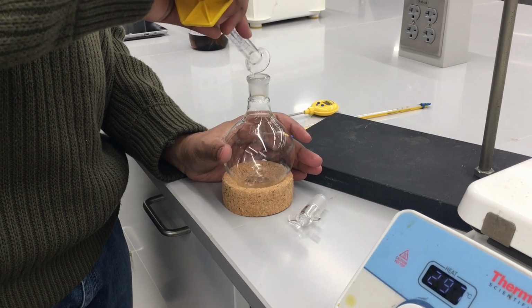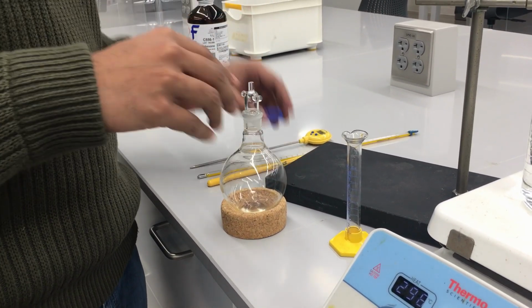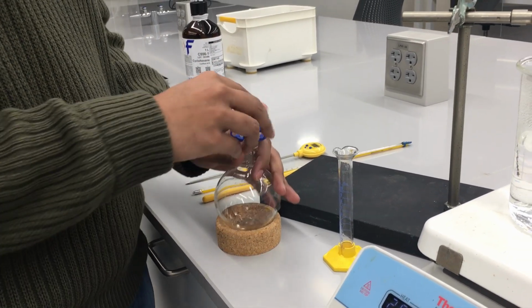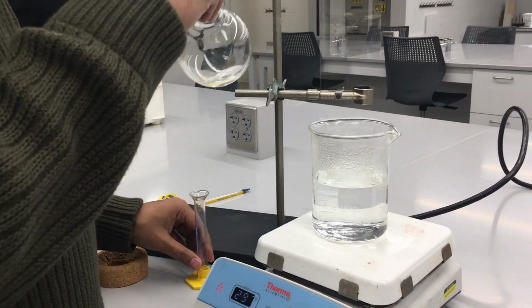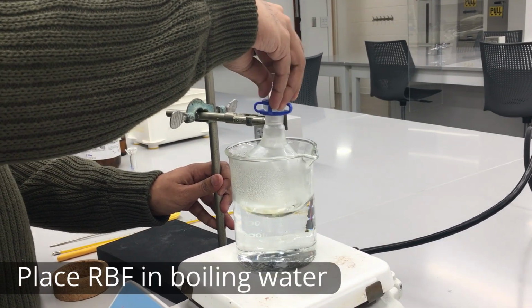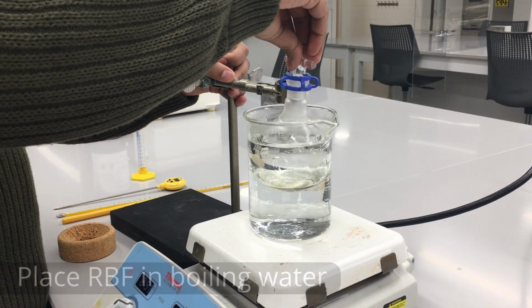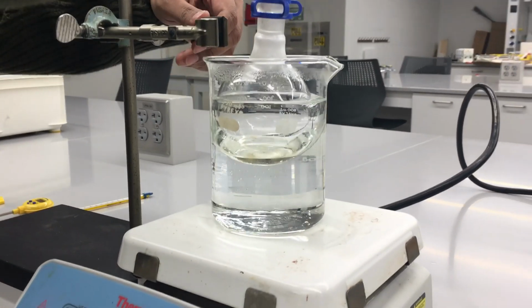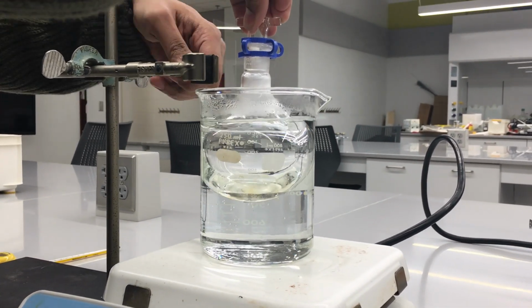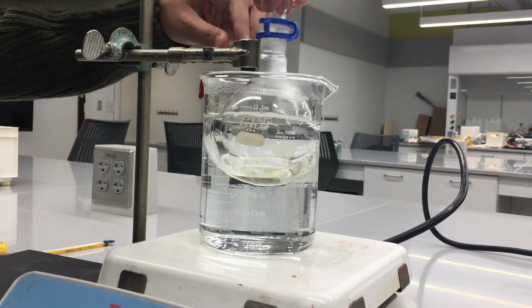A round bottom flask is very useful because it will be able to house our vapor when it turns from a liquid to a gas. Go ahead and clamp it to make sure that that stopper is secure. And I'll place that into the boiling water. Once I've secured it, the boiling water will turn that liquid volatile compound into a gaseous one, which is the point we need to do.